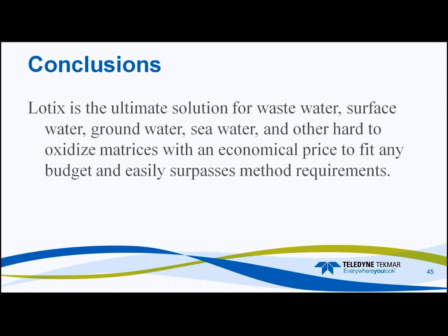That will put me at 620 to 680. If I move to a 0.2 mL loop with the large sphere platinum catalyst, could we be pushing upwards of 1,000 salt samples? We will see.